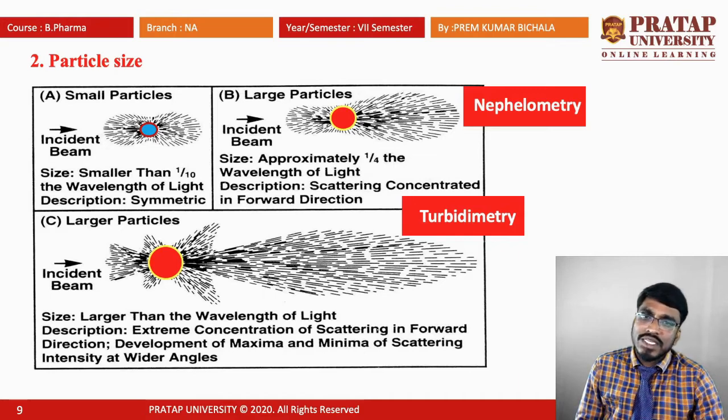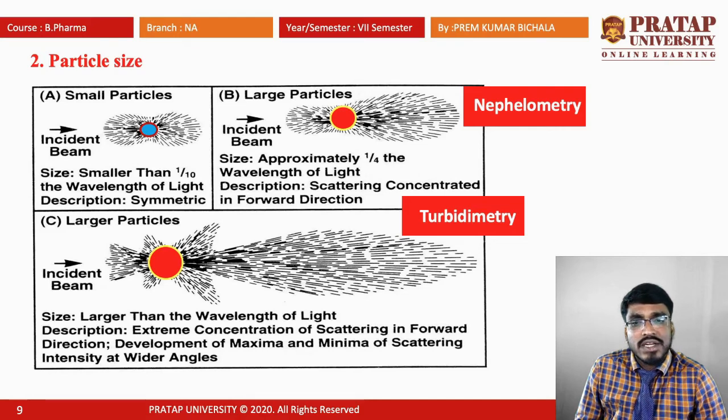If the size increases to approximately 1 by 4th, the scattering is concentrated in the forward direction.